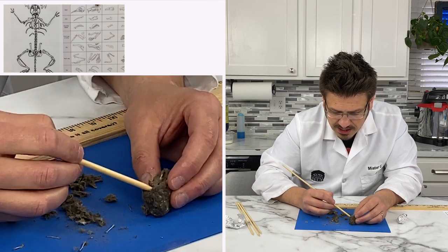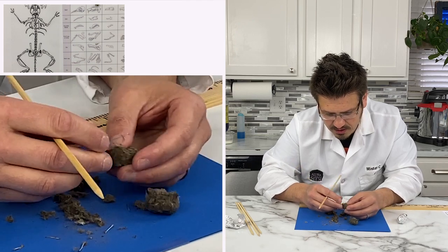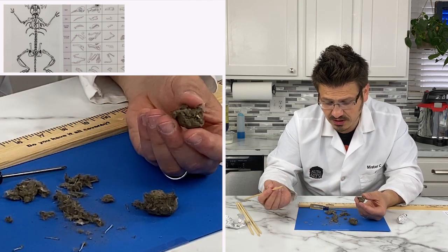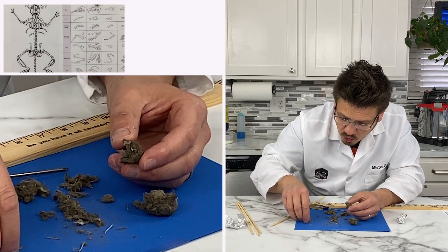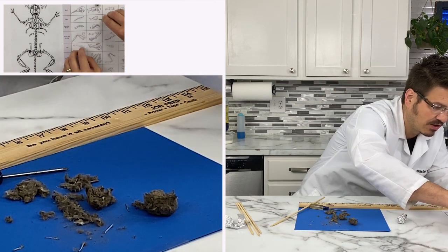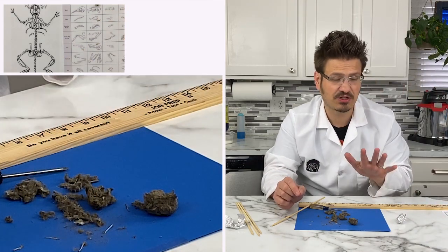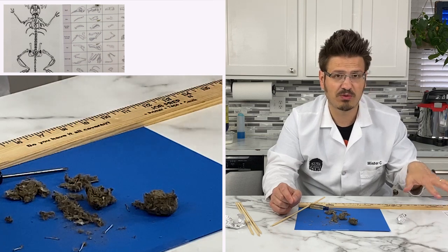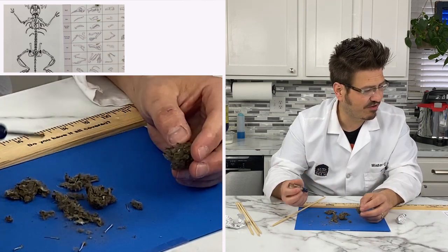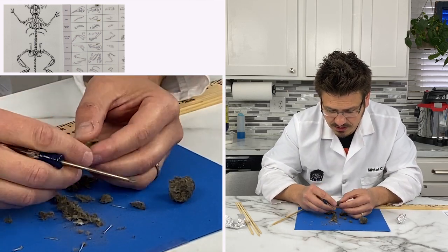All right, let's see what else we got. I'm hoping, come on. I hope we have another skull. So you might be thinking, why are you doing this, Mr. C? And realistically, I'm doing this. Ooh. I found the bottom half of the jaw. That's so cool. After today's stream, we will go through and take really close pictures of these so you guys can see them really well. Maybe we'll get enough parts to actually build a skeleton out. That would be really cool.